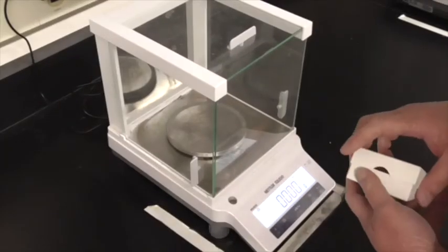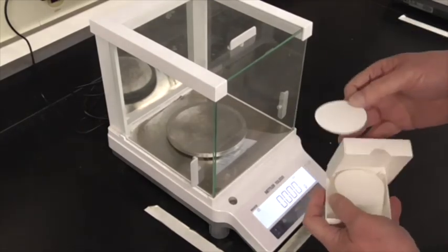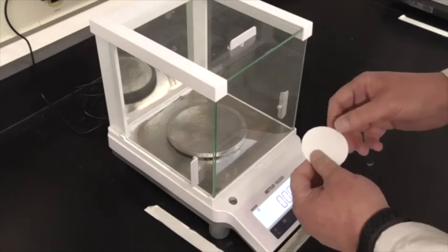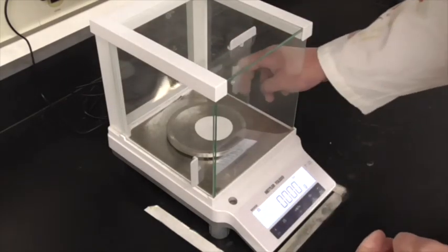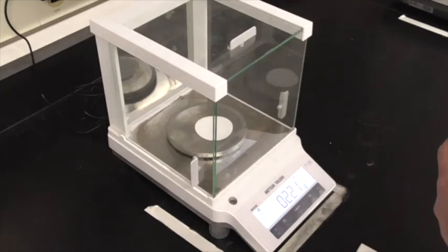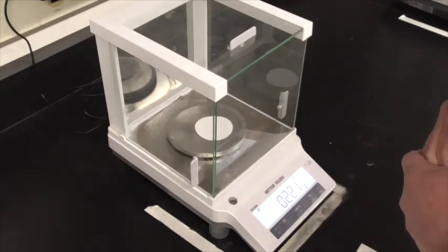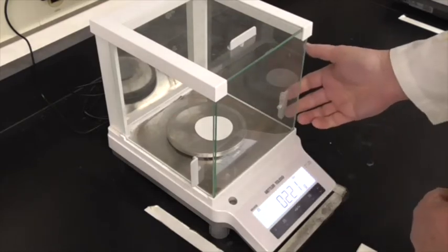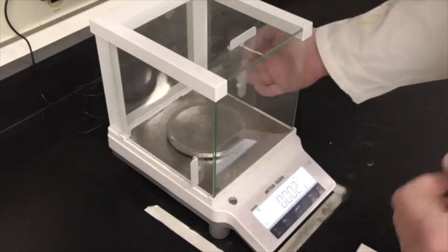Okay, so we're at the balance. We need to get the mass of a piece of filter paper. We're going to grab one of these. They're a bit smaller than the ones we use for the calcium phosphate. Just throw that on there. So that filter paper has a mass of 0.221 grams. So now we can go filter our product.